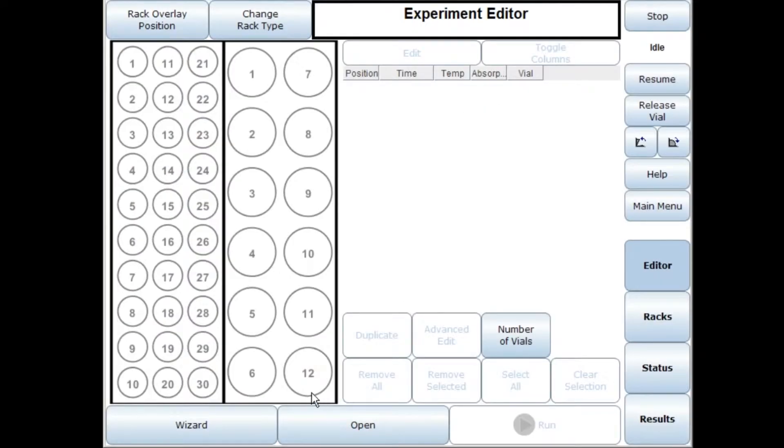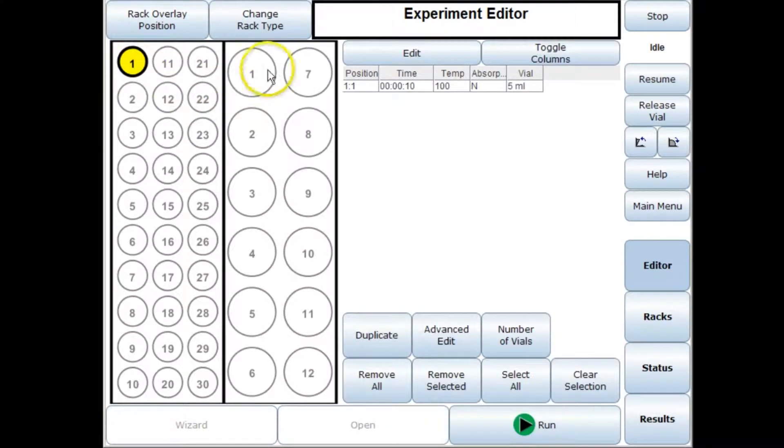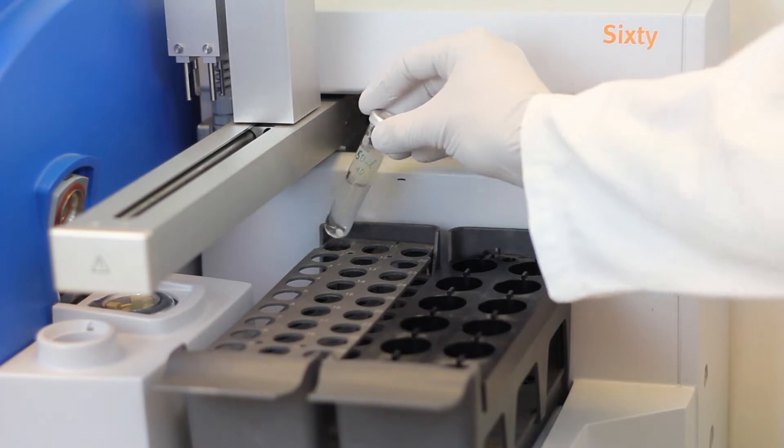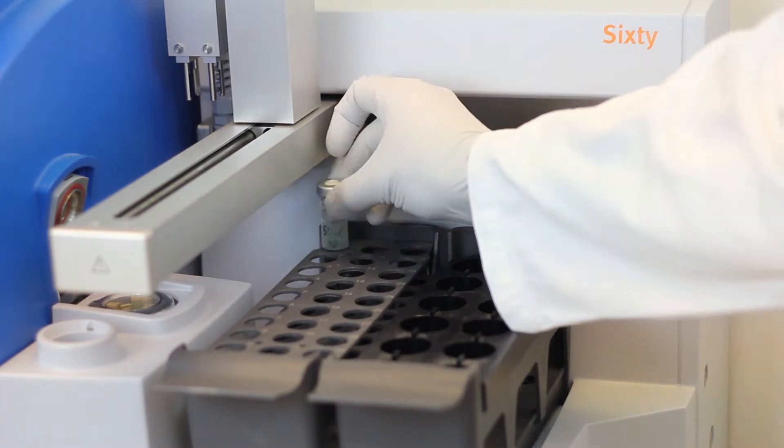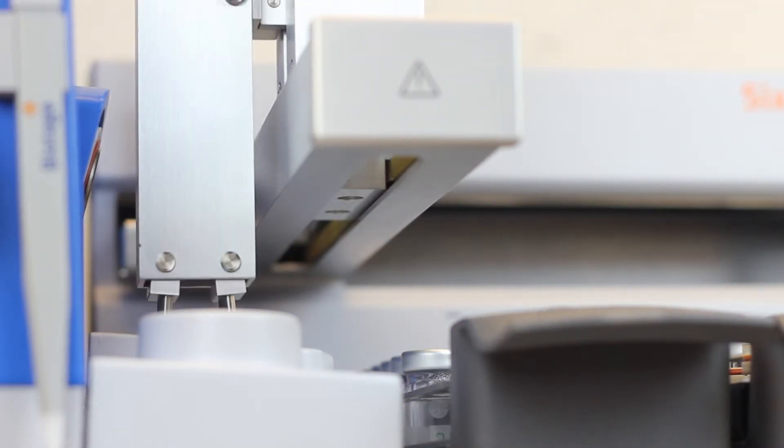One of the biggest advantages of having automation is that I can set up a reaction. Let's just say I want to do a reaction here on a 5 ml vial. We'll run that. That can be running.